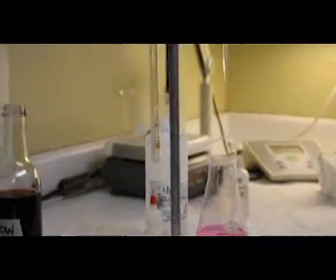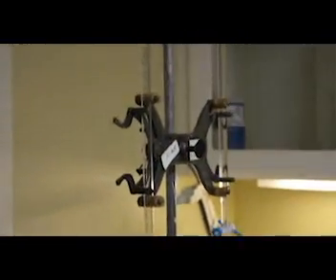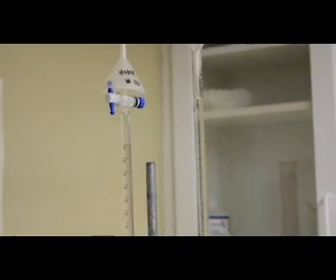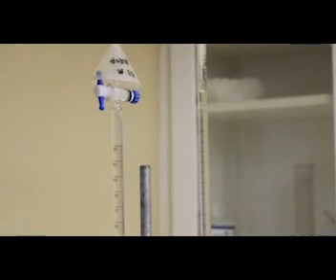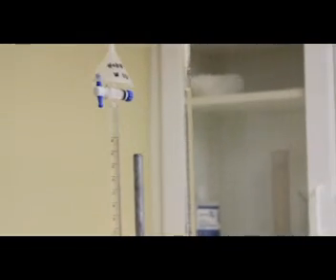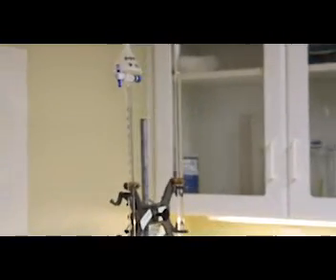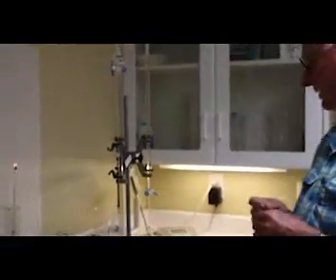So reading off of the graduations here, we used 1.1 milliliters of 0.1 normal sodium hydroxide, and you multiply that times 0.6, and you get your VA level, which is 0.66.